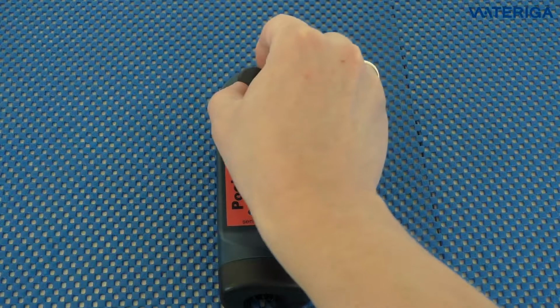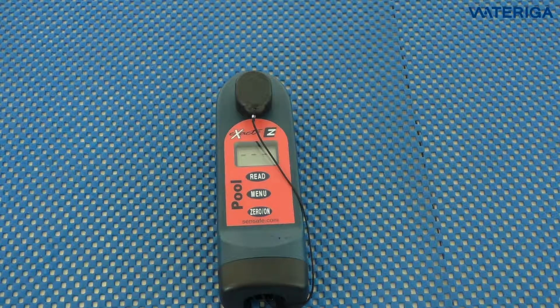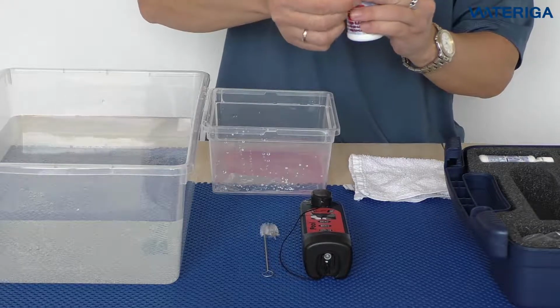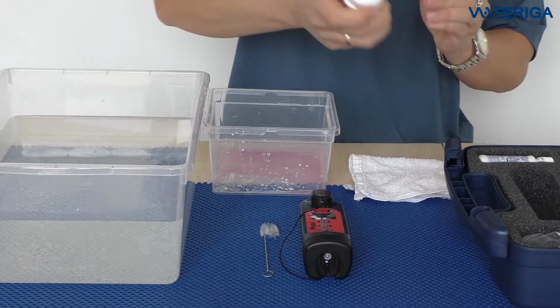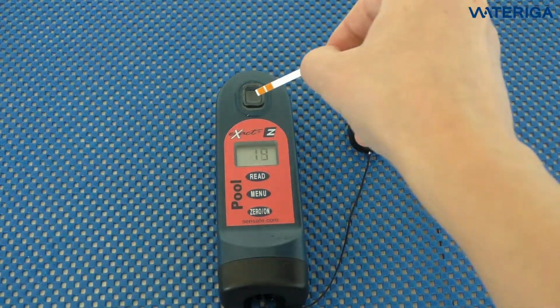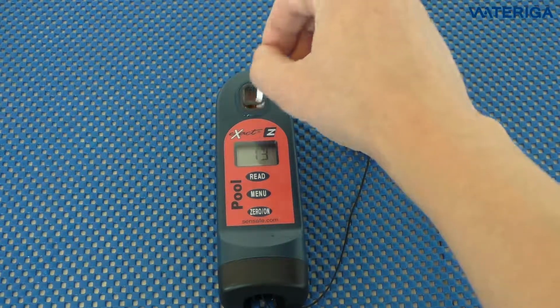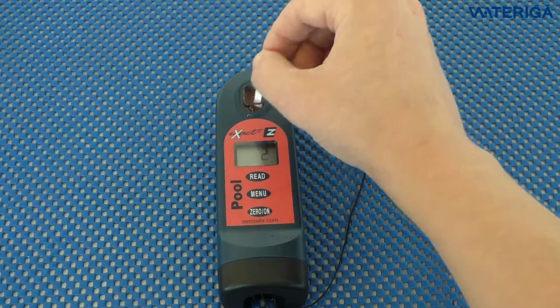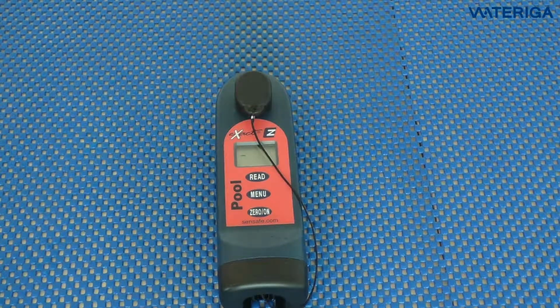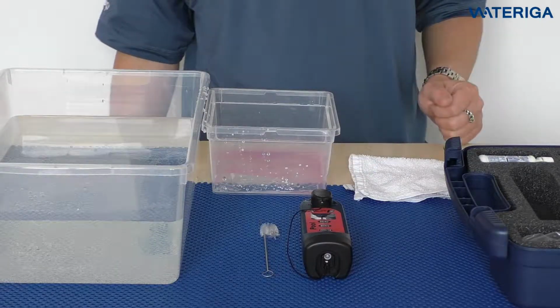Place the cap over the cell and press 0. Take the pH reagent. Press read. Again, 20-second countdown, and you just need to move the strip back and forth like this so the right amount of reagent is being released. Remove the strip at 1 and place the cap over the cell for reading. The result is being shown on the screen.